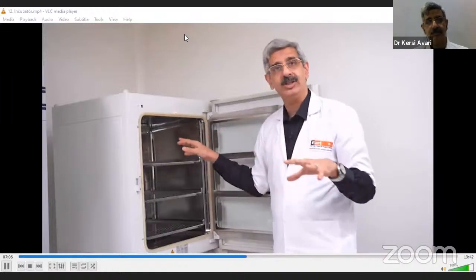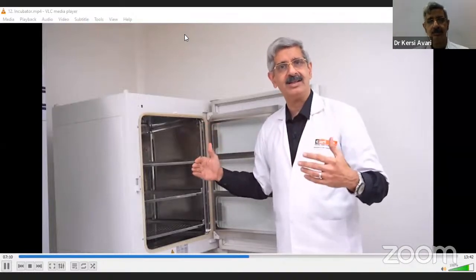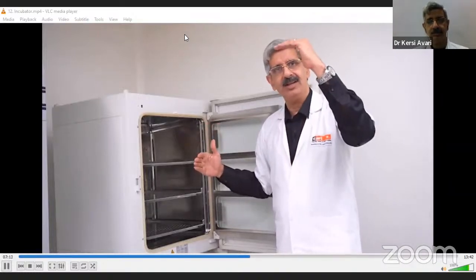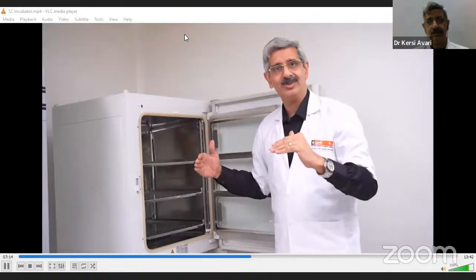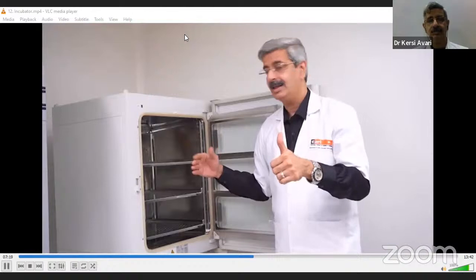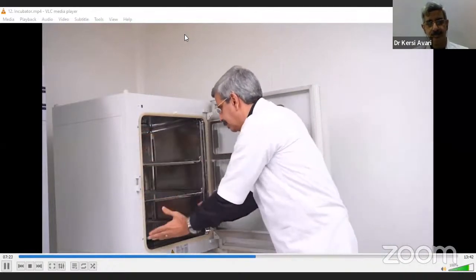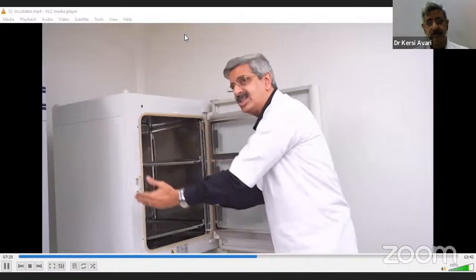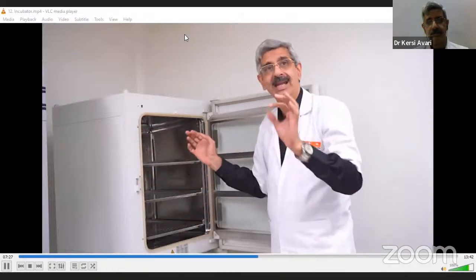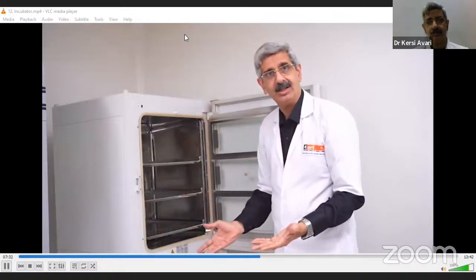Now this alarm which you hear is the piezo effect. Means if you keep the door open for a certain time, the carbon dioxide and the temperature drop. So when it drops to a little dangerous level, it will sound an alarm. The pattern of circulation is it comes throughout and it turns over. So the whole dead space or any workable area will be flushed with the carbon dioxide.